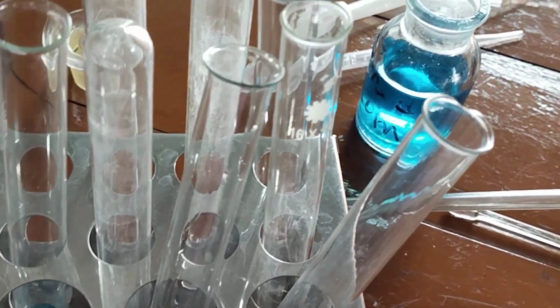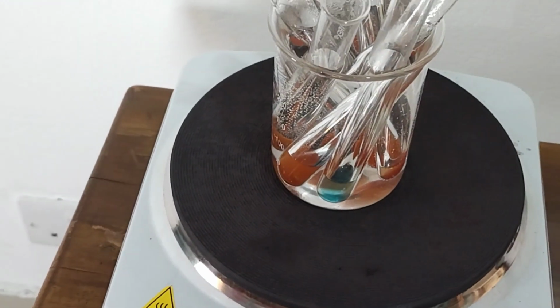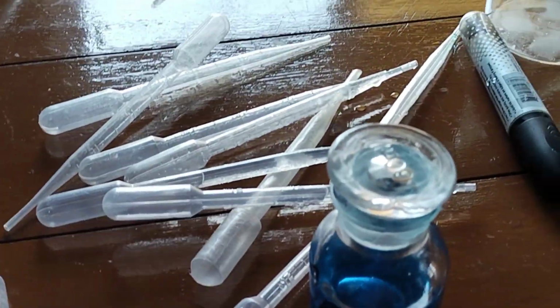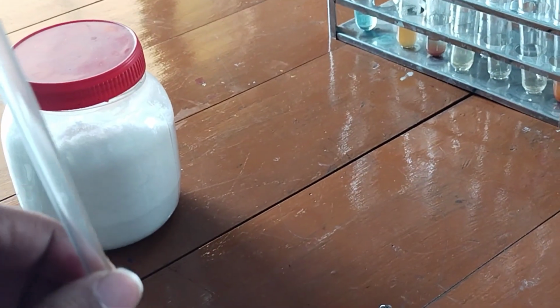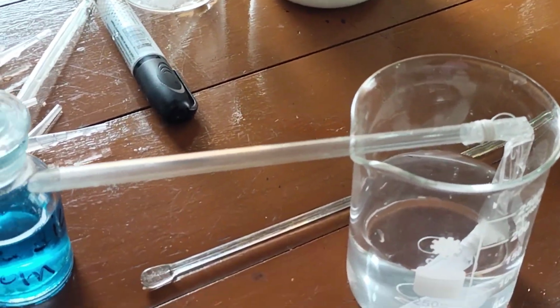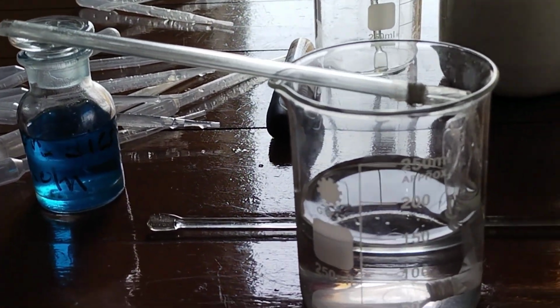This is the benedict solution, and place this solution in a water bath. Okay, now this is the iodine solution and this one is benedict solution. At first I am placing this visking tube with solution inside water, then we will wait at least 5 minutes.